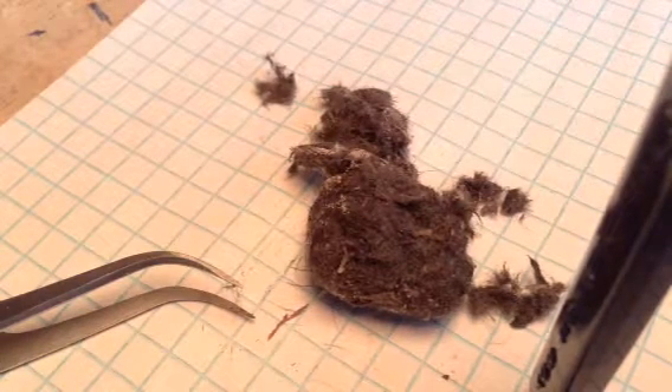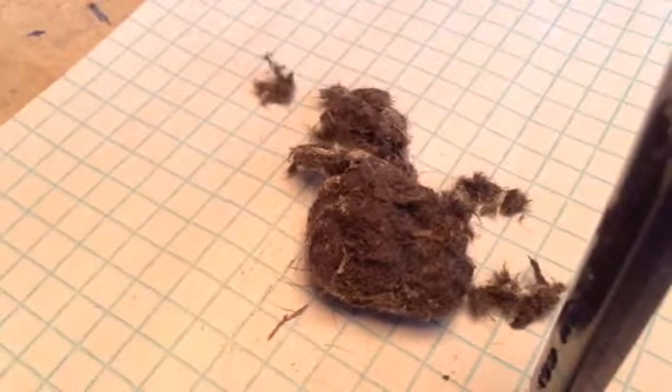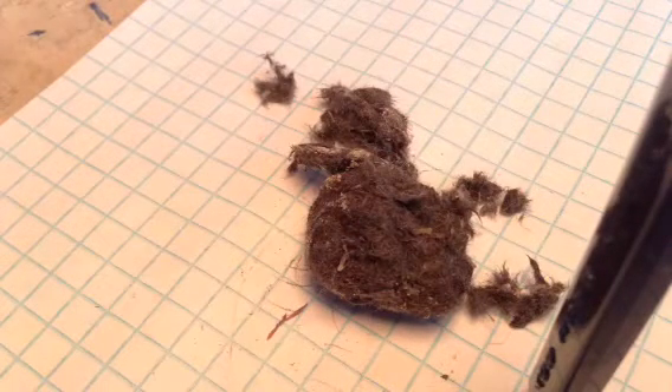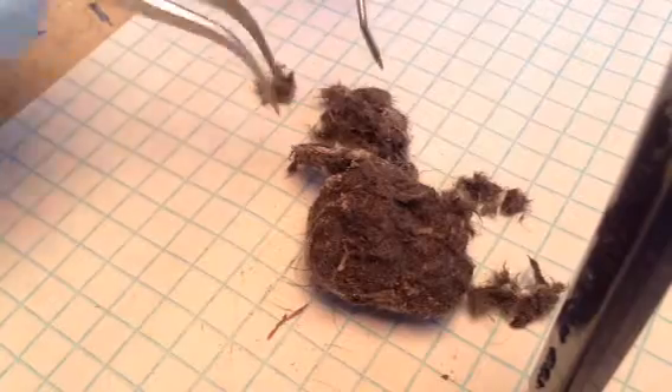Alright, this is the second video in the series. I'm going to continue to dissect this owl pellet. Enjoy.